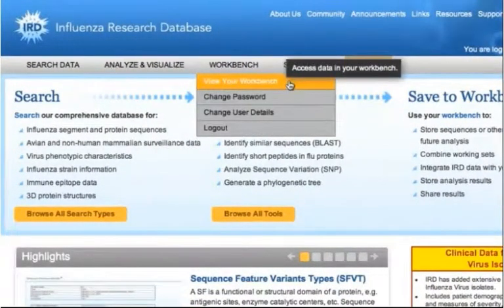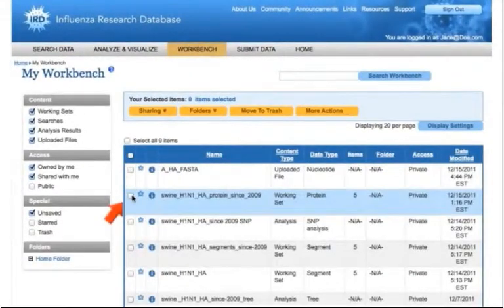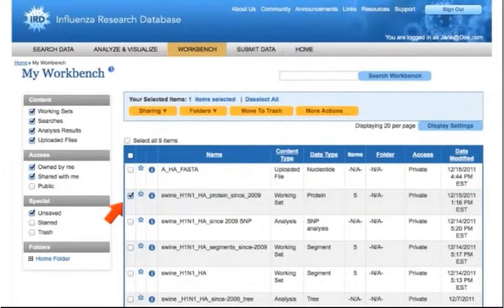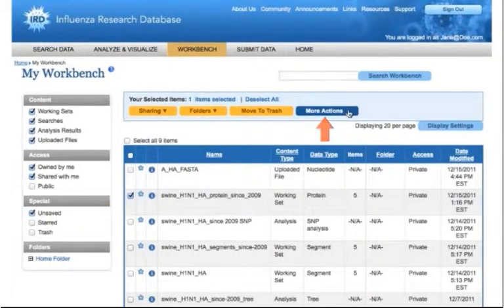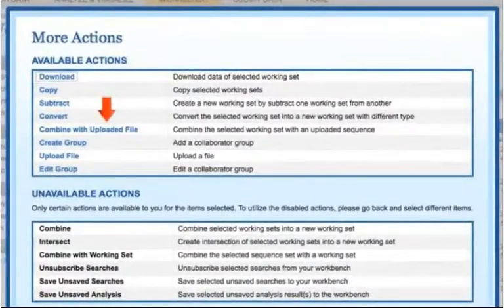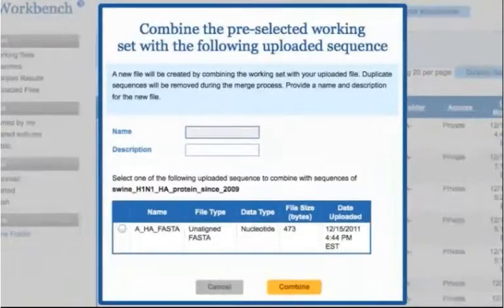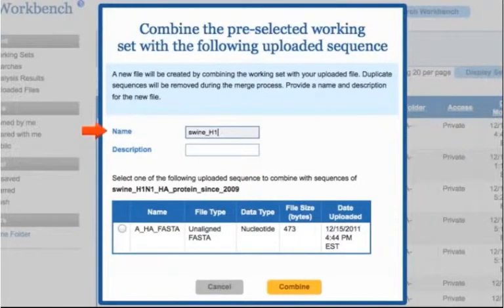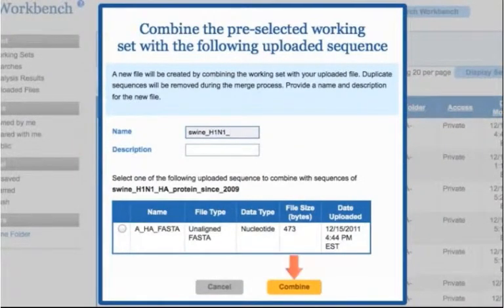Navigate to your workbench and check the boxes next to the desired working sets. Next, click the More Actions button and the Combine with Uploaded File link. Select the desired uploaded sequence file from the list of uploaded sequence files. Enter a name and description for the new working set and click the Combine button.